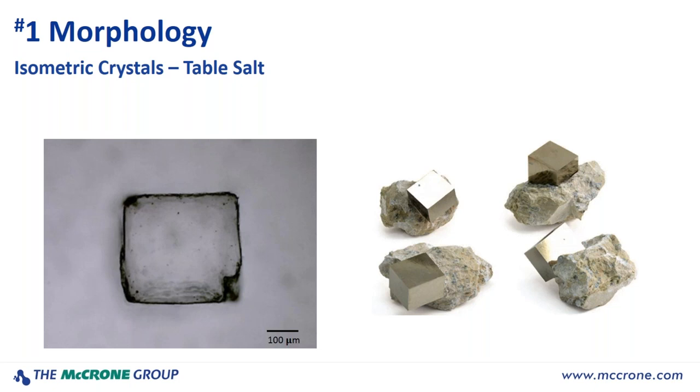So as I see the salt cube here, this is a very large crystal. It can be processed, ground up smaller. And even though it may not be a cube itself, the unit cells, or the individual molecules that make it up, are indeed isometric cubes.